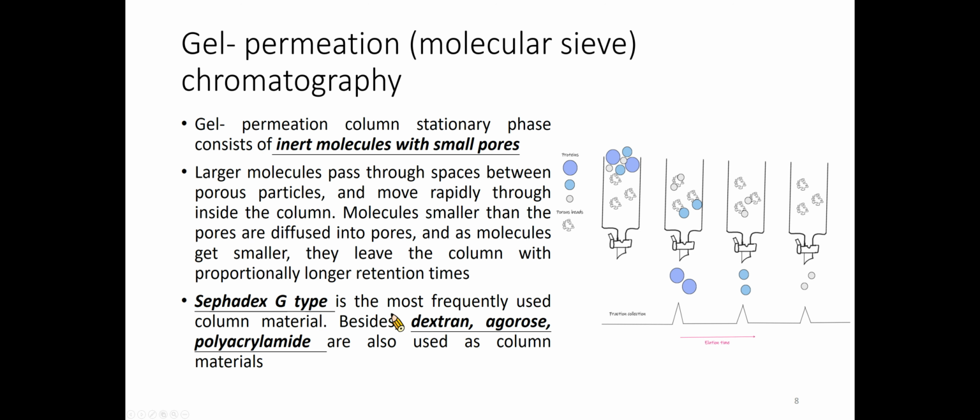The molecules in the samples are pumped through specialized columns containing microporous packing material. The basis of the separation is that molecules above a certain size are totally excluded from the pores, while smaller molecules access the interiors of the pores partially or wholly. The flow of the mobile phase hence will cause larger molecules to pass through the column, whereas smaller molecules will be retarded according to their penetration of the gel.